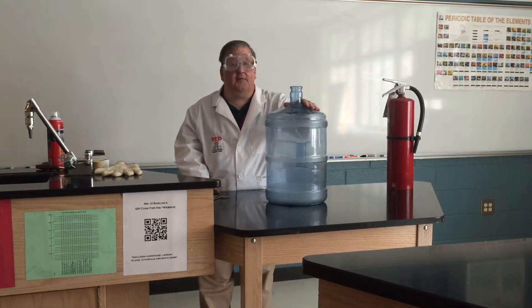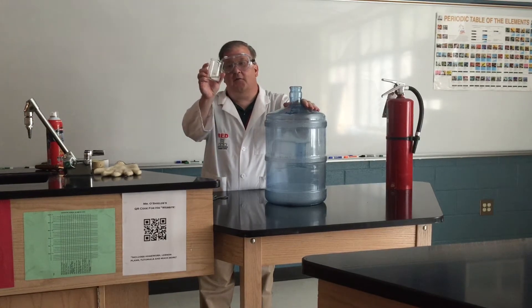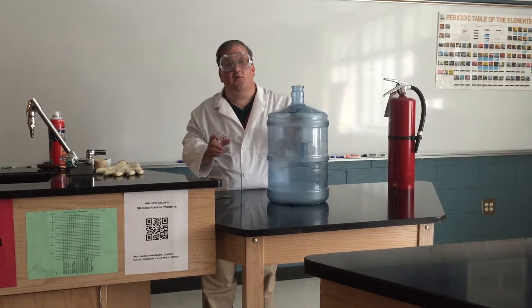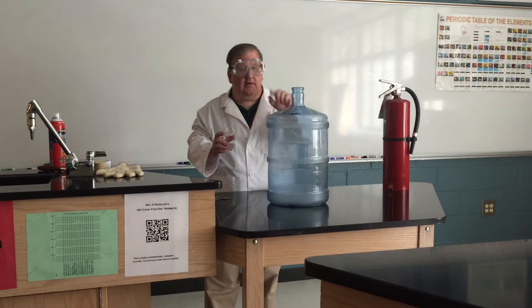Today we're going to do another whoosh bottle demonstration, but this time I'm going to use 91% isopropyl, also called rubbing alcohol. Like all the demonstrations, you are warned not to do these or try these at home. We are in a controlled environment in a lab. We have our goggles, our apron, and fire extinguisher handy, so do not try this at home.